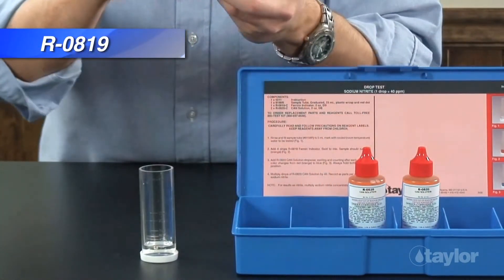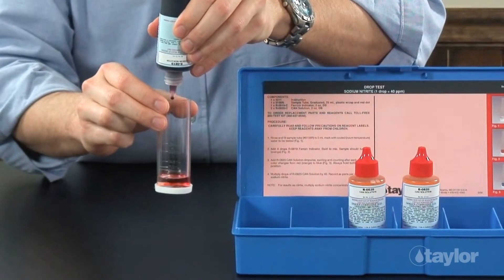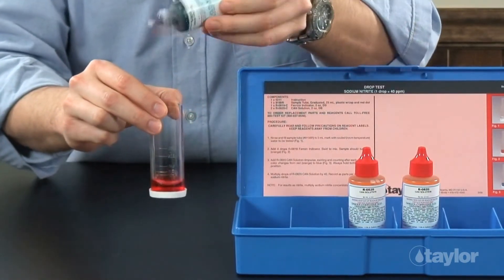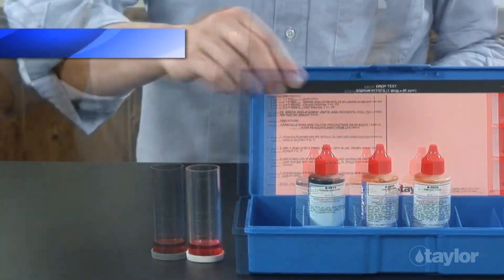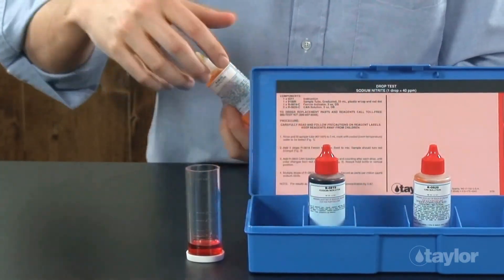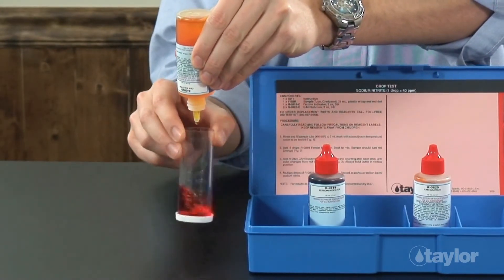Rinse and fill this 25 ml sample tube to the 5 ml mark with the water to be tested. Holding the bottle vertically, add 4 drops of reagent 819, the ferroin indicator. Swirl to mix thoroughly. The sample should turn reddish-orange. Again, holding the bottle vertically, add reagent 820 CAN solution drop-wise, swirling and counting after each drop, until the color of the treated sample changes from reddish-orange to blue.